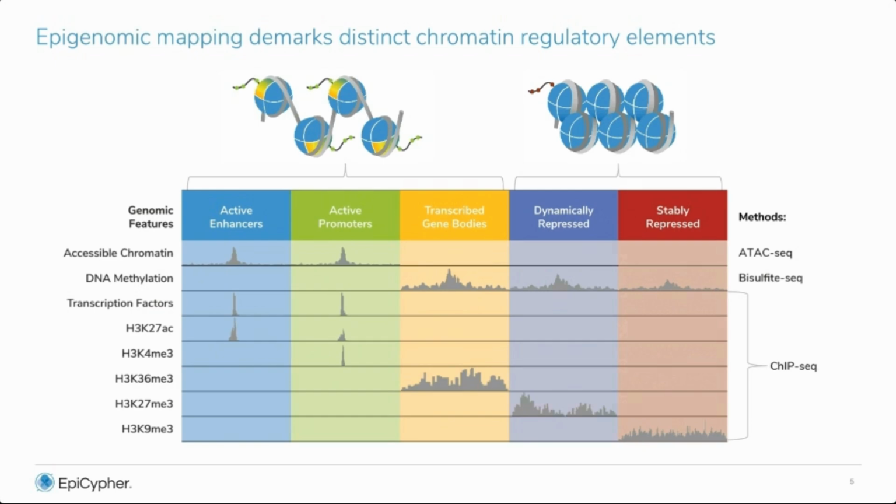And so ChIP-seq depends really on the specificity of your antibody. And this is particularly problematic when it comes to histone PTMs, because asking an antibody to distinguish between a mono versus a di versus a trimethylation at one specific site is quite a tall order. And in addition, antibodies might cross-react across lysine sites.